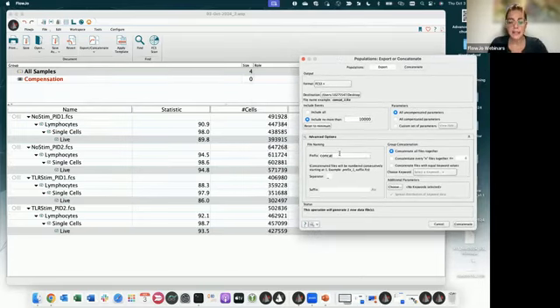Now, we are almost done. We can assign a name. And we can choose to concatenate all the files together that we have chosen, or just every n files together, and then files, for example, with equal keyword values. But in this case, we want to concatenate everything together.